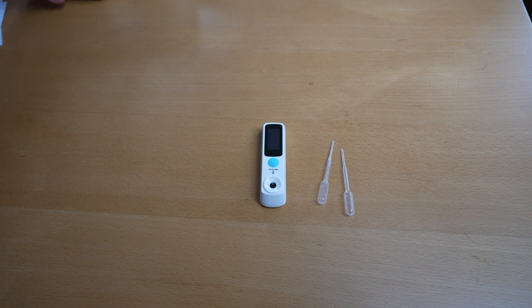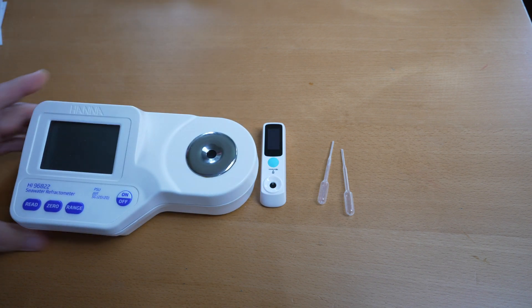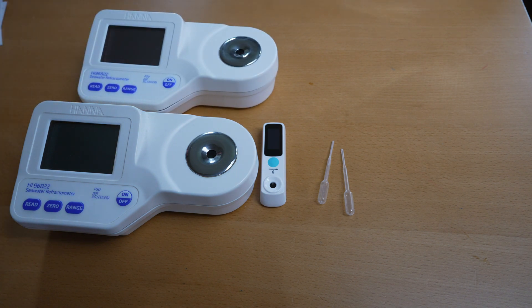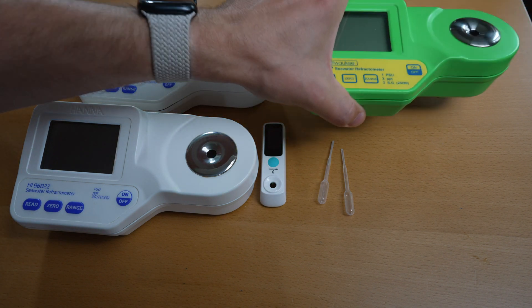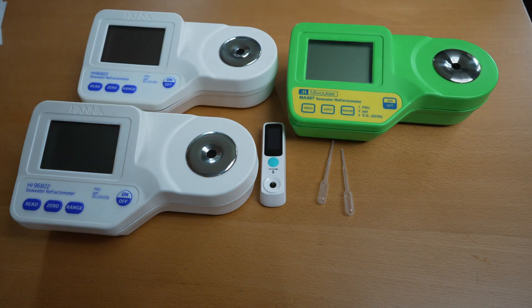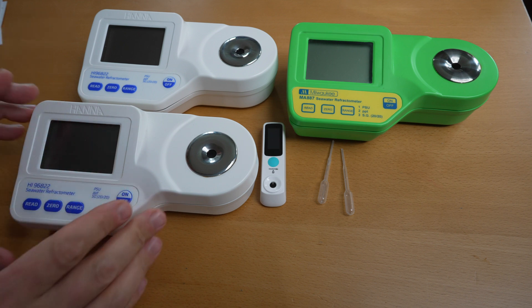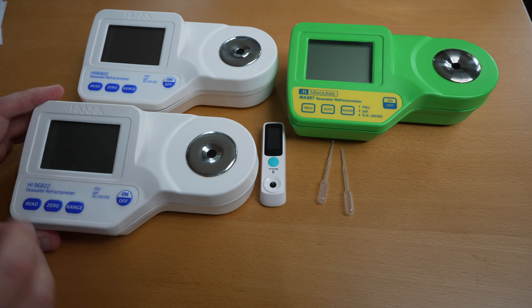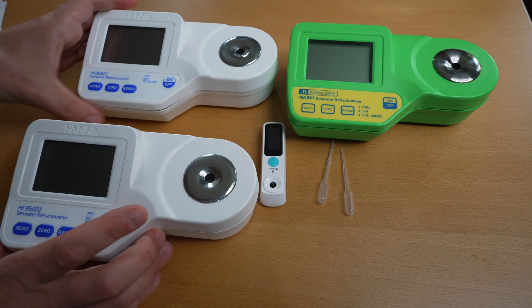What I'll be comparing this unit to is not one but two HANA refractometers, which I absolutely love — this is my gold standard. I also have my trusty Milwaukee refractometer. We could really geek out and use every single refractometer I have around the house, but I want to compare apples to apples since they all work on the same principle.